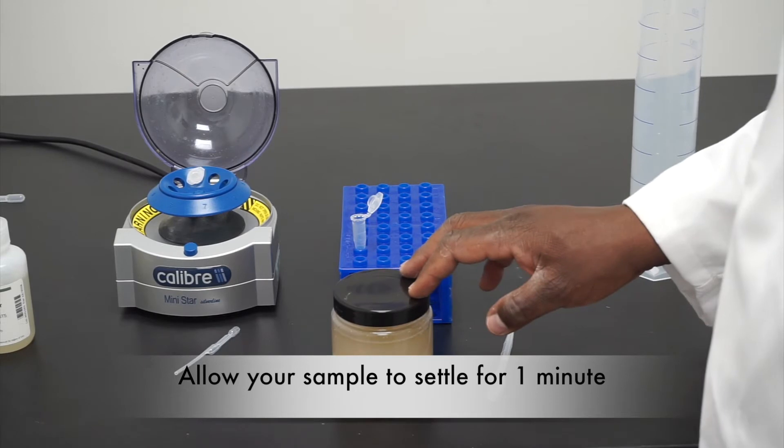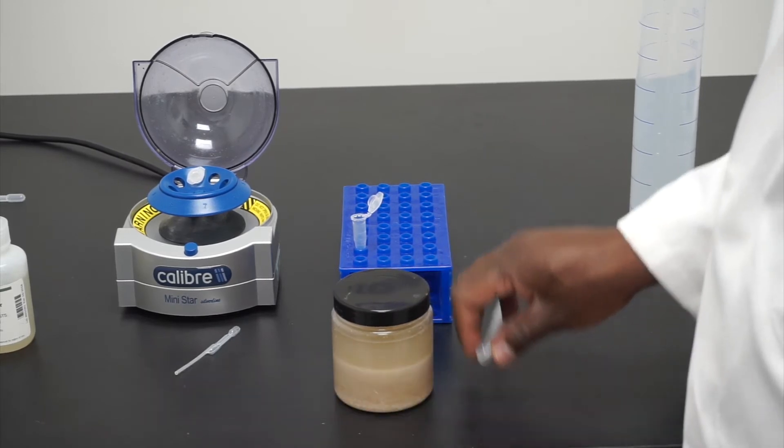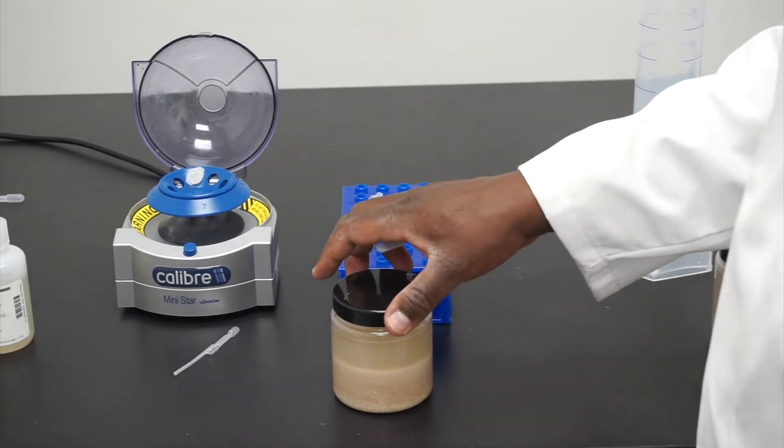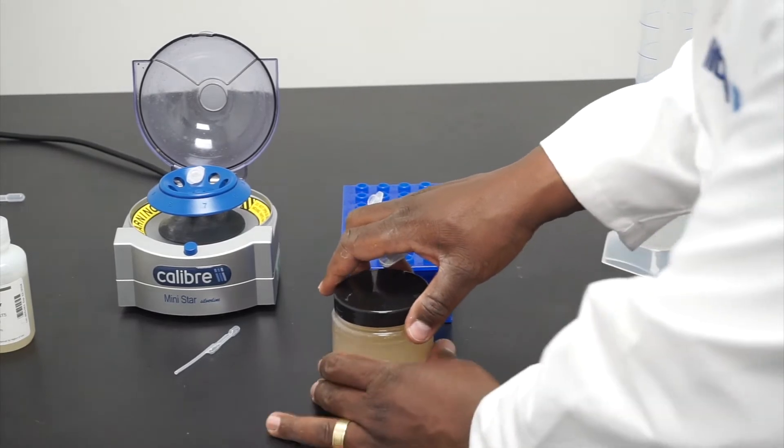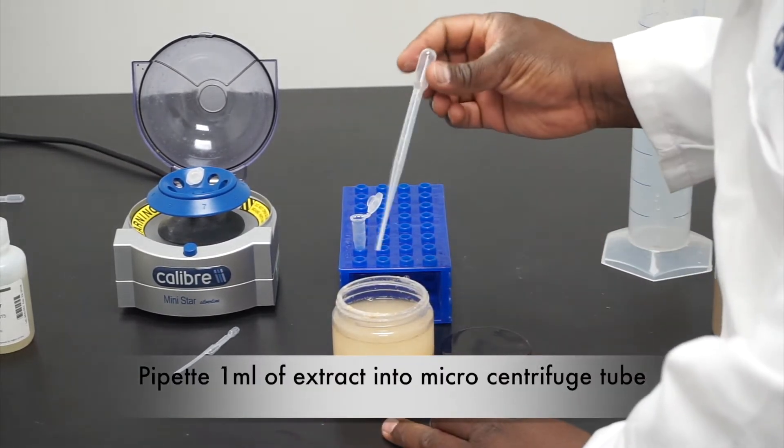After allowing your sample to settle for a minute, dispense between one milliliter and one and a half milliliters of the extract into a microcentrifuge tube.